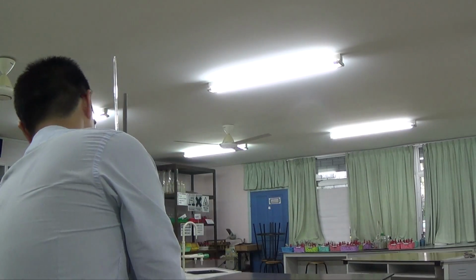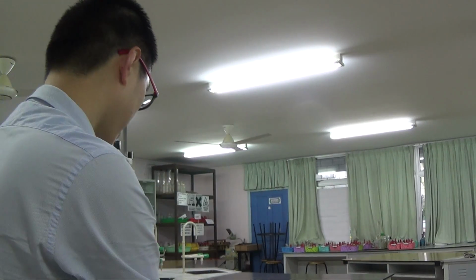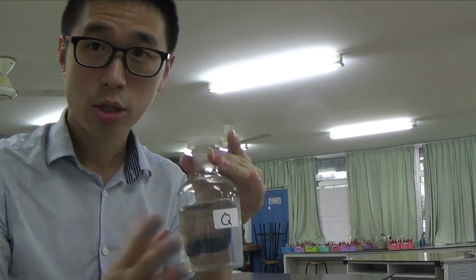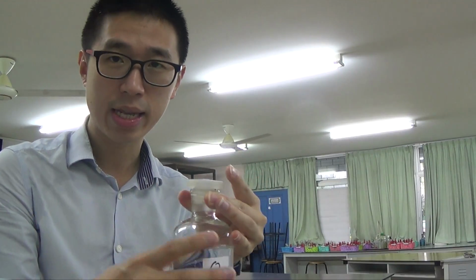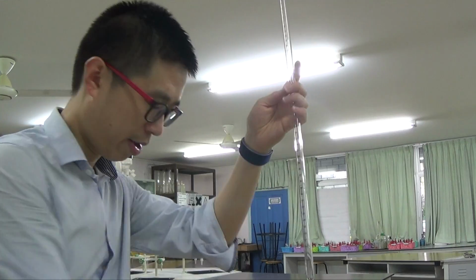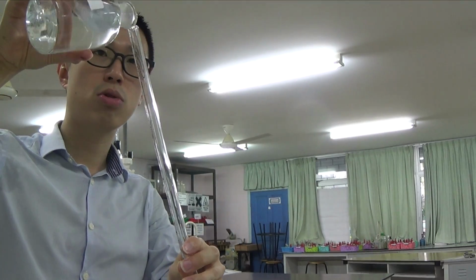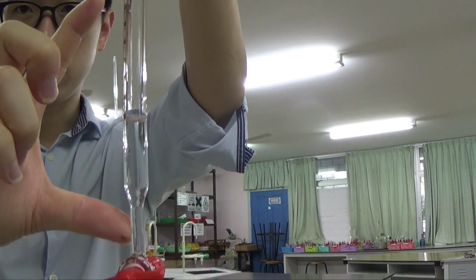We know that P, being the iodine, is going to go into the pipette. And Q, which is our thiosulfate, Na2S2O3, sodium thiosulfate, has Na plus ions and S2O3 2 minus ions, so it's a 2 minus charge ion. I'm just going to quickly rinse my burette before I forget. Put a little bit in there for rinsing, maybe just a little bit more. You don't need to fill up the whole burette. Roughly around that much should be alright.